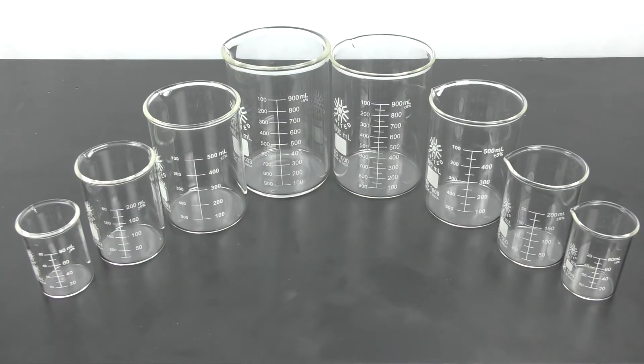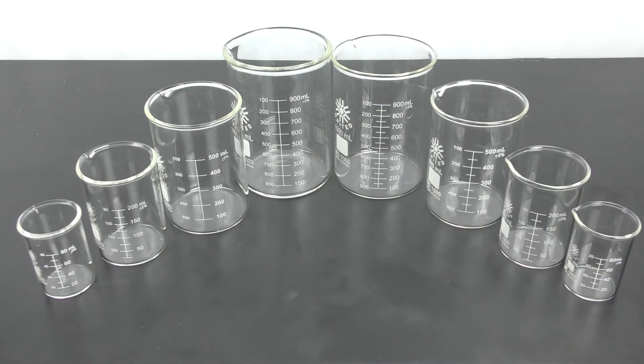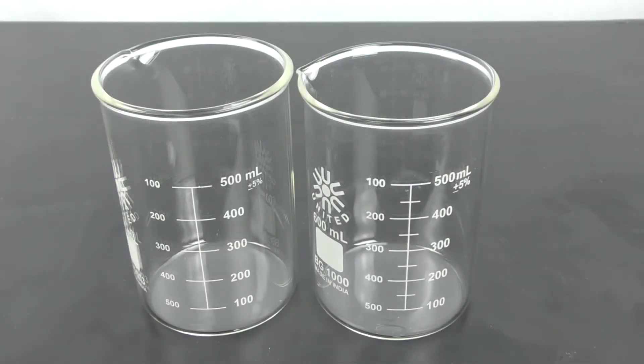When choosing the correct beaker, there is more involved than just the volume. There is the graduation range and wall thickness. There are regular beakers and there are heavy duty beakers. The main difference is the amount of glass used in production.